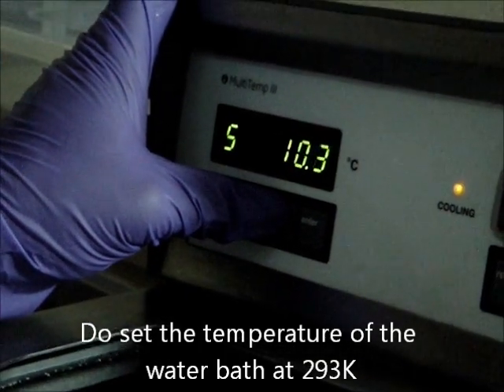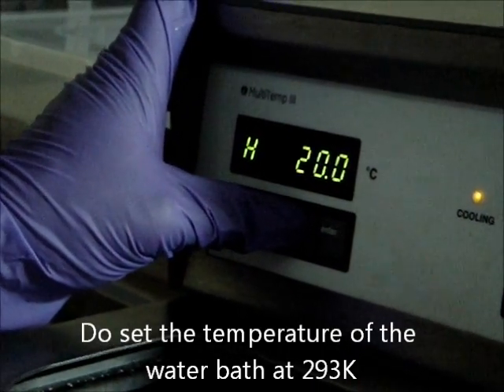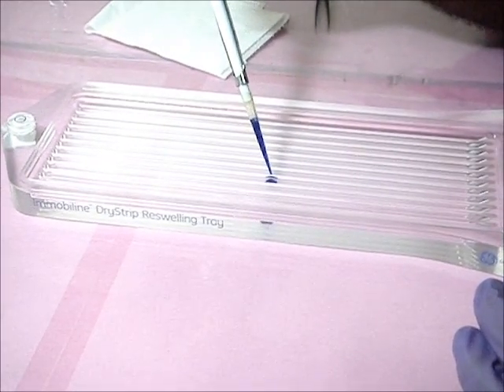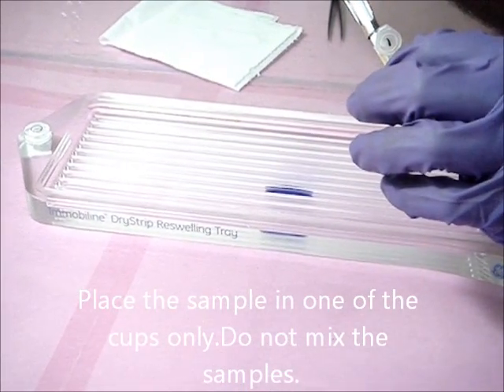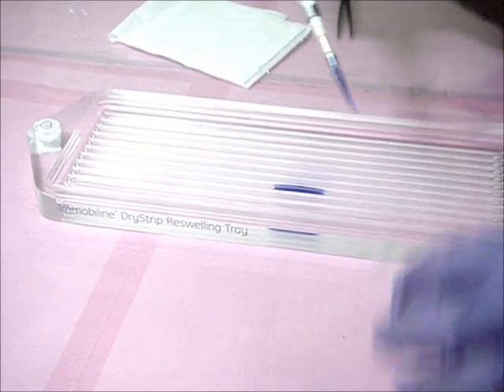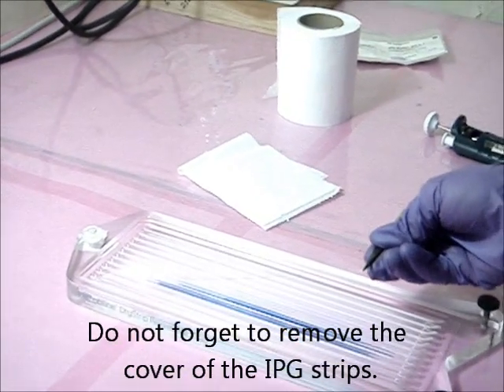Step 2: First Dimension. Mix 350 microliters of the protein sample with the rehydration stock and carefully place it over the sample holder. Carefully remove the IPG strips and place them over the sample.